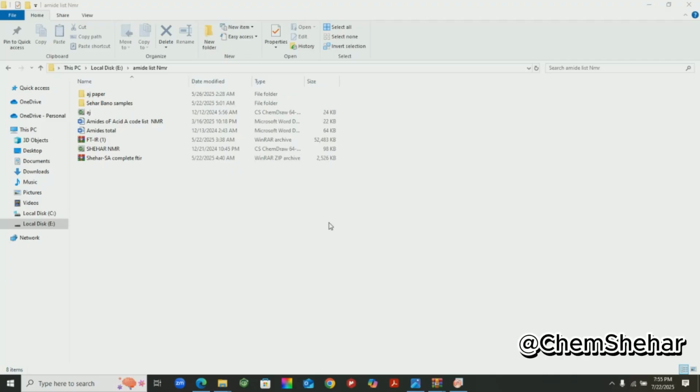As part of our research in synthetic organic chemistry, we often encounter data that requires smoothing and refinement. Today, I will be discussing some techniques on how to smooth rough data, specifically in FTIR spectroscopy. FTIR utilizes a mathematical process to convert raw data into a readable spectrum. However, this spectrum can also be rough and require smoothing. Let's start by opening the rough FTIR data file.